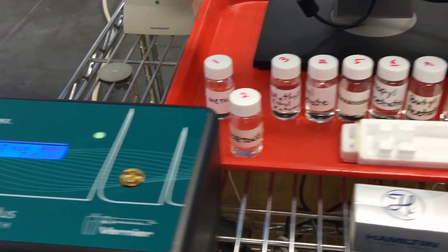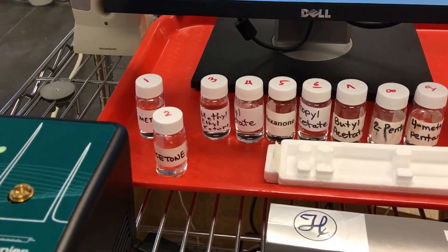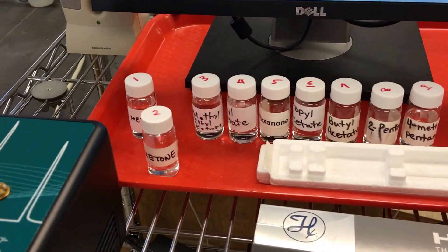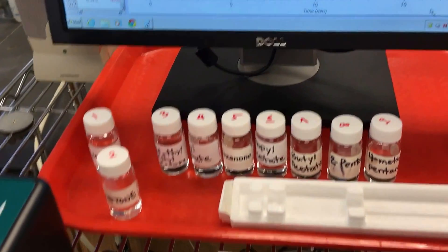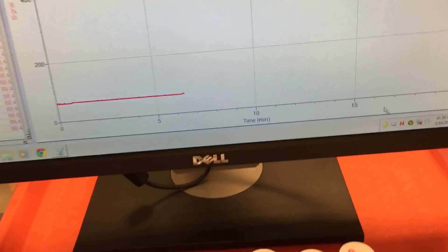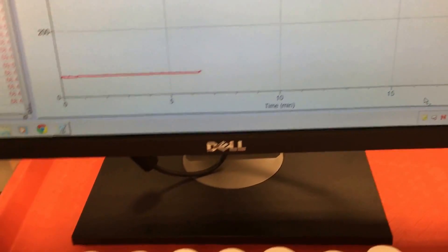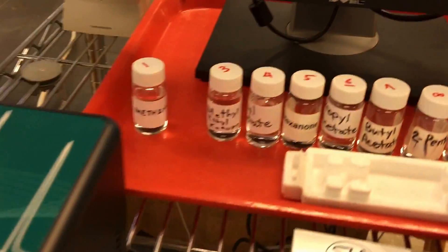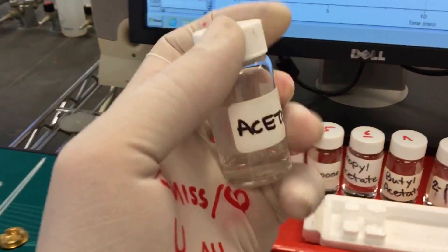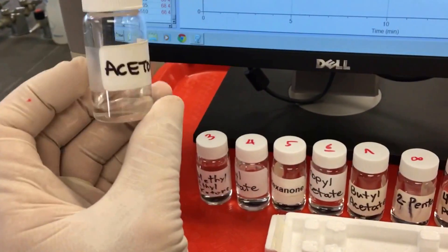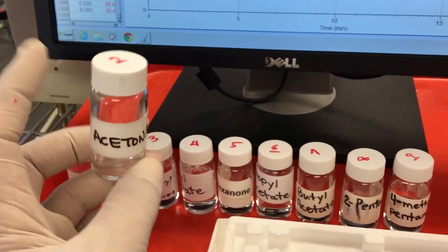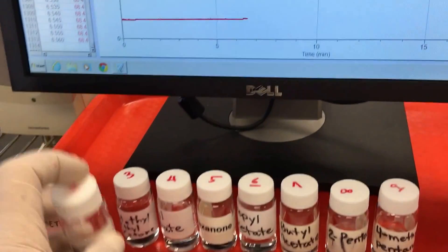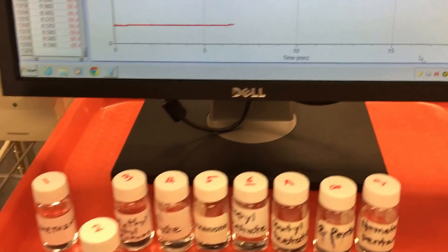Before we start, I'll show you the run through. I practically self-diagnosed and then injected. Actually, I did already. I cleaned the column inside with just about 5 microliters of acetone. I think it's a good one, it's pretty volatile, so I already injected.